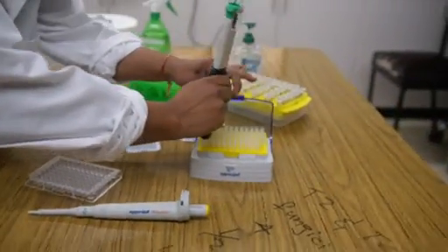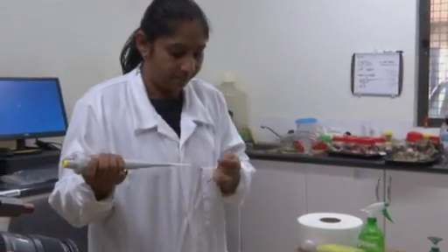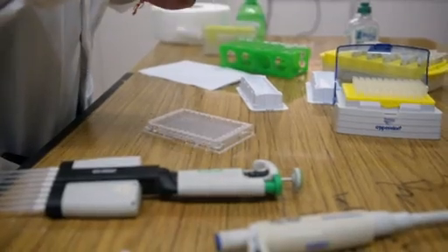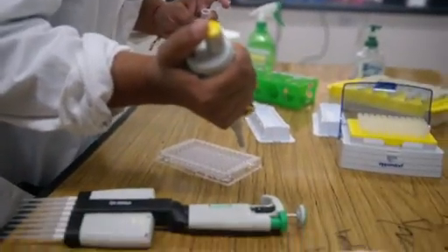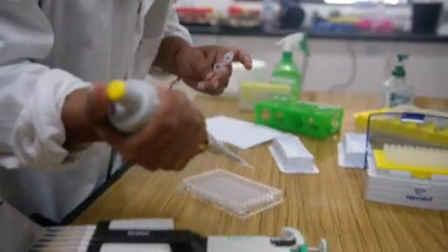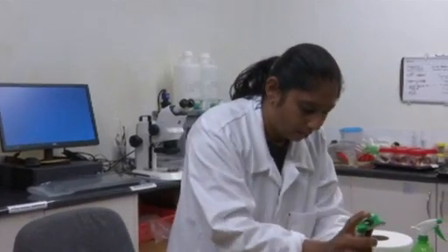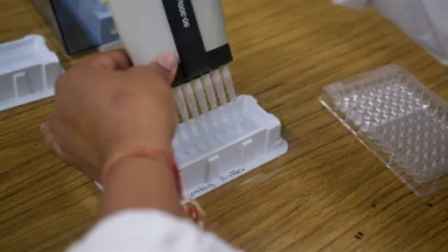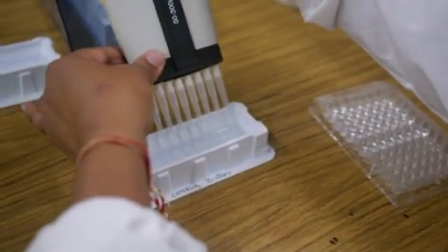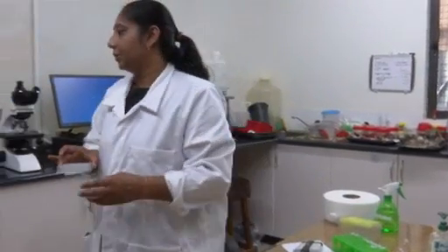With the help of a multi-channel pipette, we put the sap inside this plate, and the empty wells we cover with the coating buffer. And then we take the plate to the immuno washer.